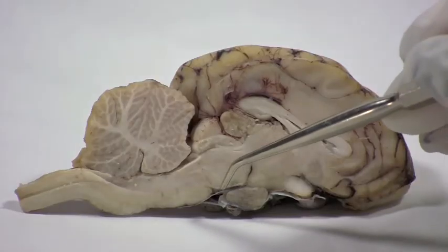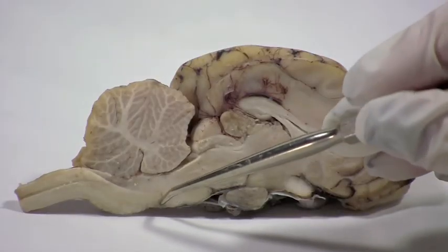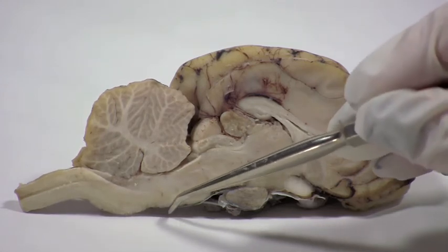Inferior to the midbrain is the pons. The pons contains two-way conduction tracts connecting higher brain centers to the spinal cord.